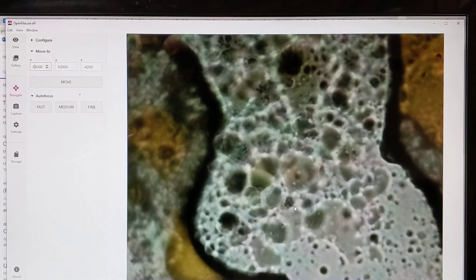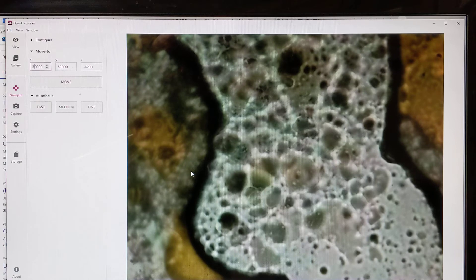This magnification is not that great. It's only using the Raspberry Pi's camera with an inverted lens.